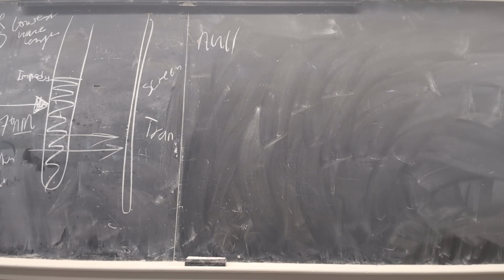So now put 0.5. Get a pipette. Three more? You have more? Okay, yeah, good. Okay, so now, why do we need a pipette? Why not use a dropper? To be more precise. So do not use the same pipette on the same pH. So fill it up all the way up there. But it's gonna be like a lot, so that's why we need a dropper. This is for you to understand that.